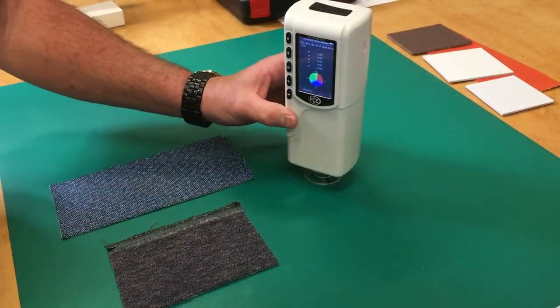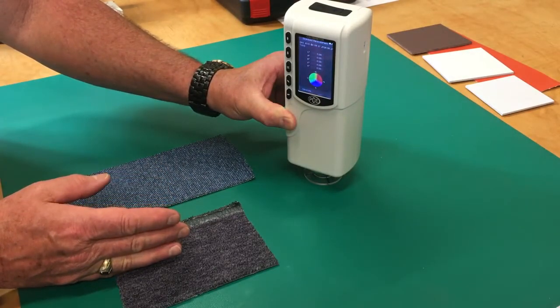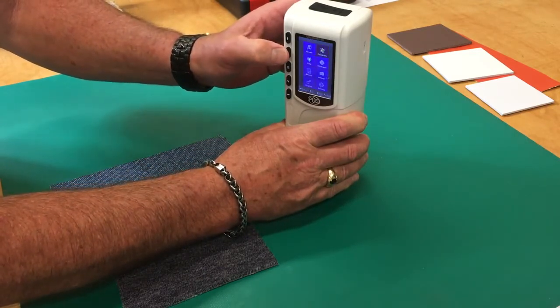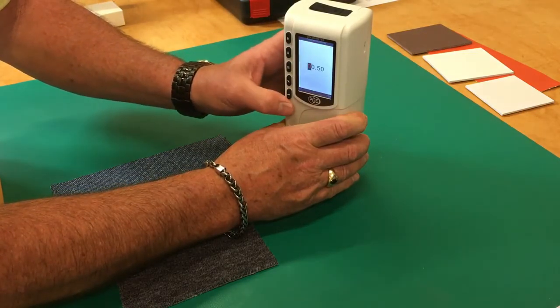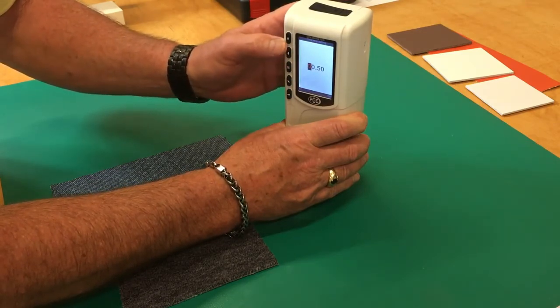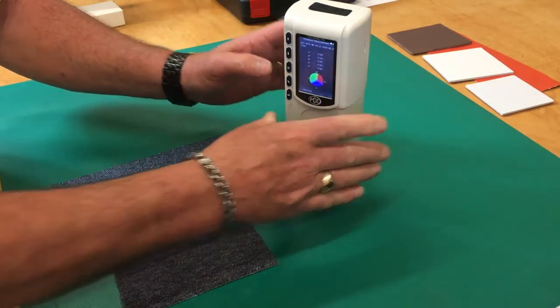The CSM2 color meter allows you to set the tolerance between two color samples. So we go into menu, select tolerance, enter, on, enter again. Here we can change this with these two arrows either up or down. After we get it set, exit, exit again. We're ready.